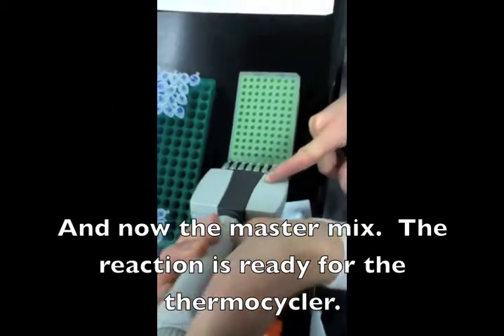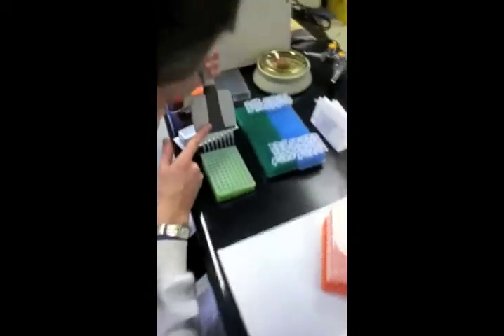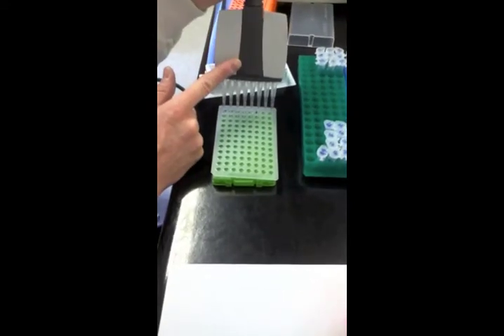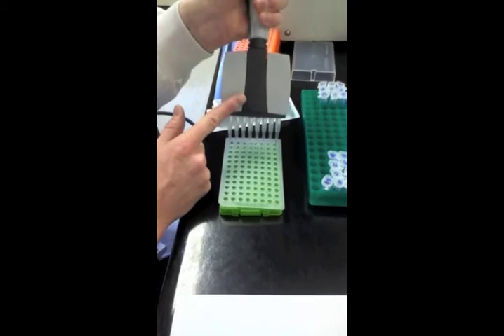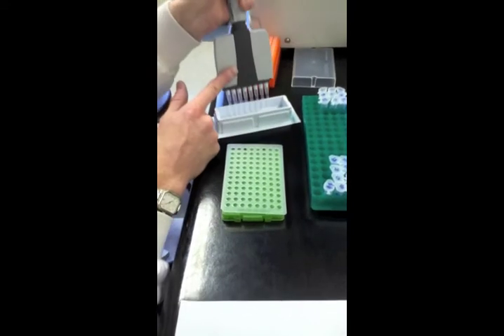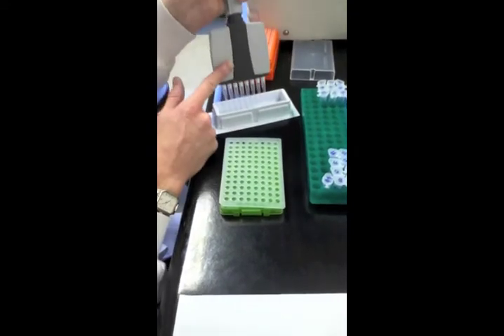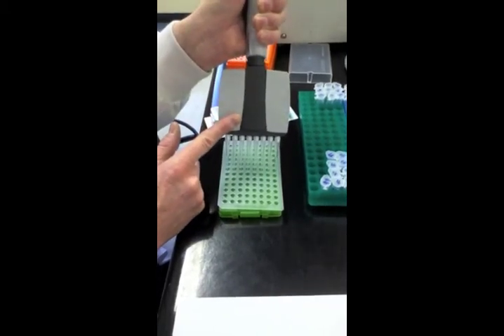I love this pipetter, so I have to be very careful not to touch the templates that are in there, otherwise I'll contaminate samples. I also have to keep track of where I am. 3, 4, 5, 6. So I'm pipetting in the master mix. That's a mix that has everything except the template.